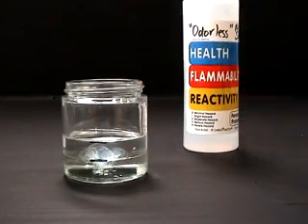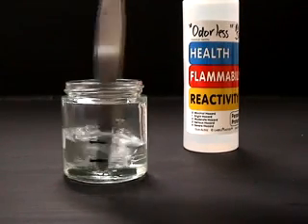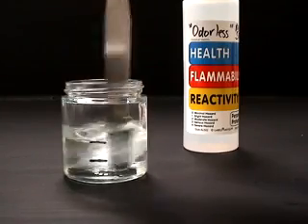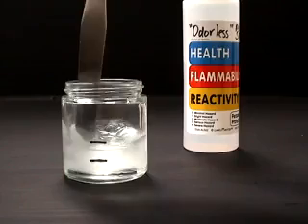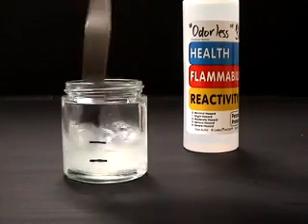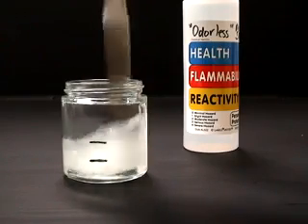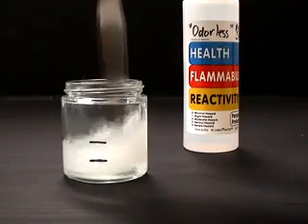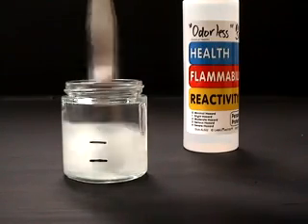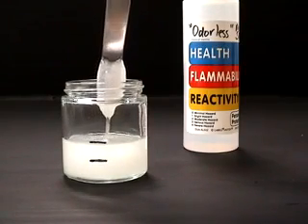The solvent is added to the fill line. Once again, there is noticeable clouding where the solvent and varnish meet. The low strength of odorless mineral spirits is due to the reduced amount of aromatic solvents, producing an immediate thickening of the MSA varnish. As the mixing continues, the gelatinous mass continues to grow. Obviously, this mixture is not acceptable for any use.